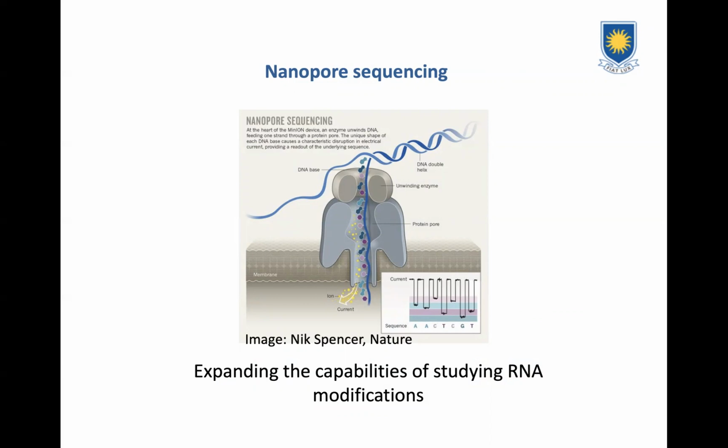And there has actually been recently a number of proof of principle papers that show that this is indeed possible, which significantly expands the capabilities for studying RNA modifications using this platform.